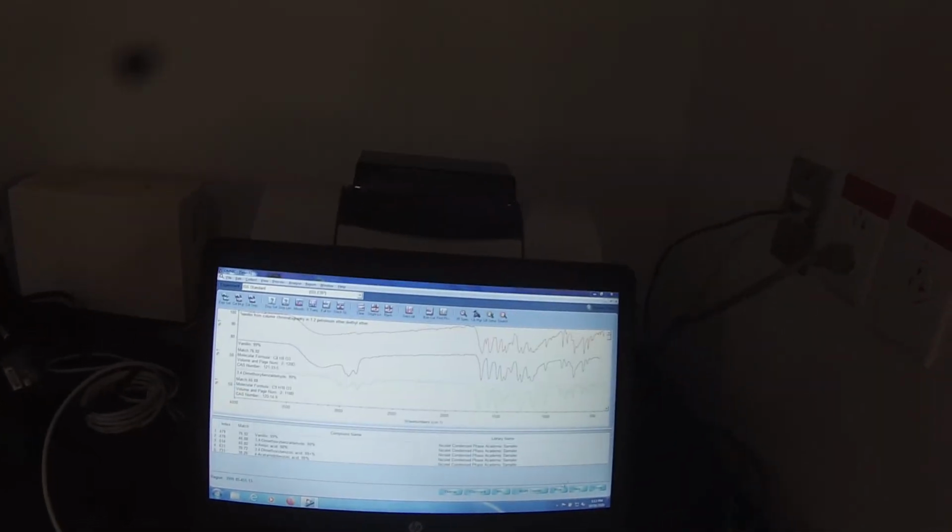Now this time we got a 76.92% match to vanillin, which is pretty good given that the vanillin in the sampler is run as a Nujol mull, so we got these hydrocarbon peaks that are showing up in the library spectrum that aren't in ours because we didn't run it that way. Oops. I'm going to cancel that. I meant to print those on separate pages.